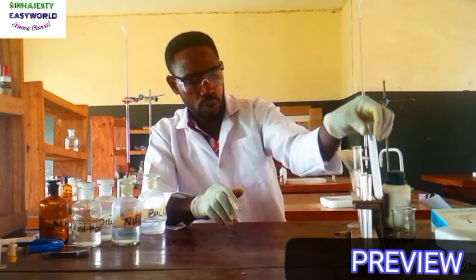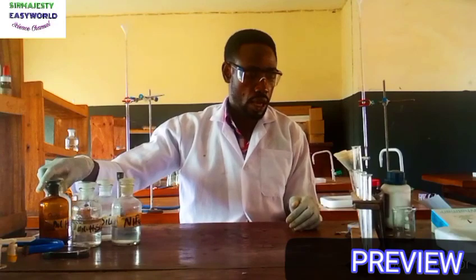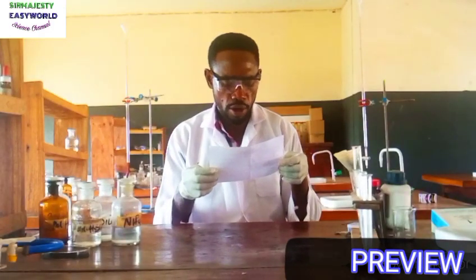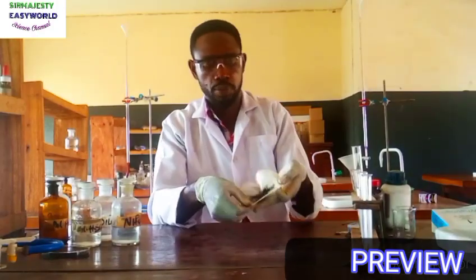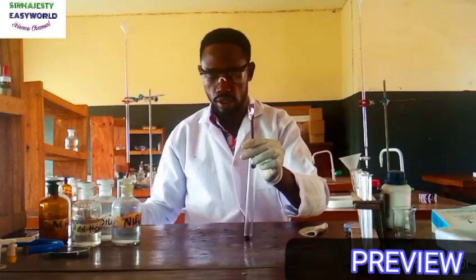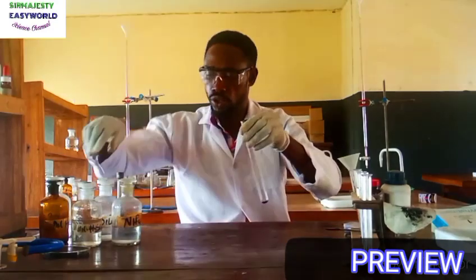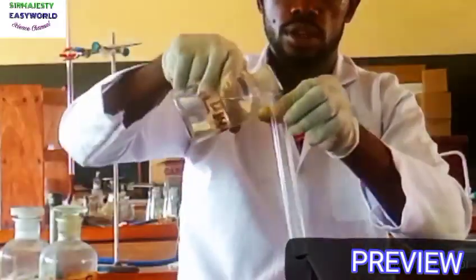So we are done with the filtrates according to the instruction. The next is the residue. According to them, the residue, with the help of spatula, we should now add the residue in a boiling tube and add about 5 cm of H2SO4. According to the question, they say we should add about 5 ml of dilute H2SO4.